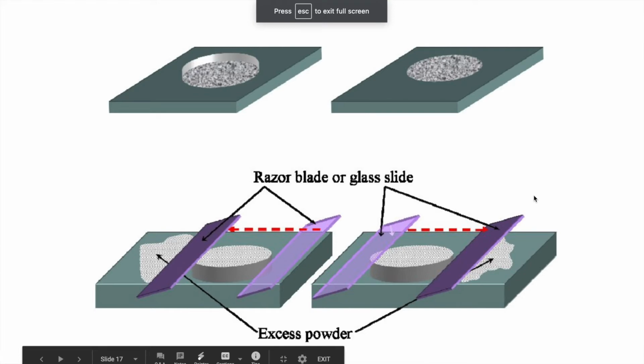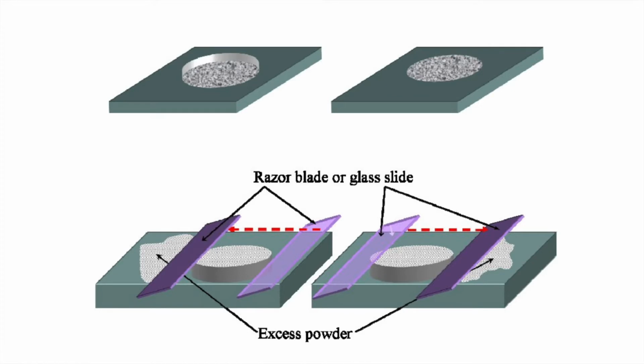Okay, let's see if we can address the question of what are some practical implications of the diffracting plane having to be perpendicular to the surface, or sorry, parallel to the surface. So in a typical experiment, we have a powder, and each separate crystal has a random orientation within this structure.